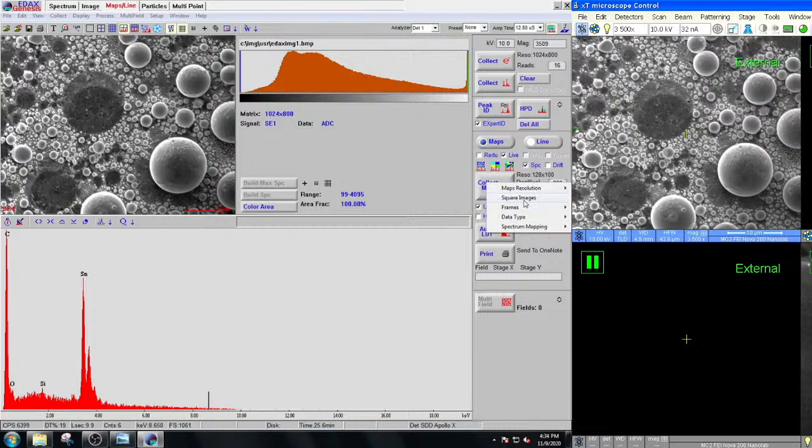The other things we can look at are the number of frames to acquire. Again, 64,000 frames is probably going to take a week to acquire at these conditions, so be careful here. Let's just do 16 frames. The regions of interest apply to these elements, so 4 ROIs means it's going to map four elements. And then you see frames on there.